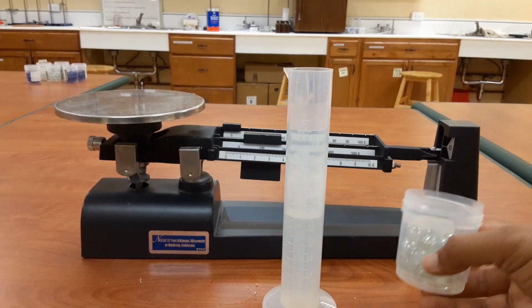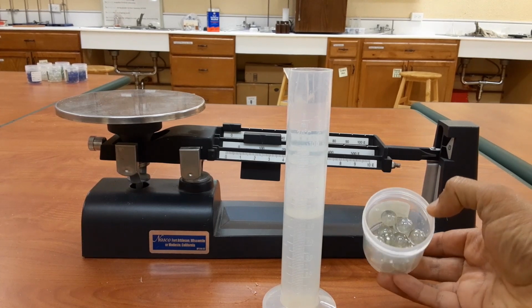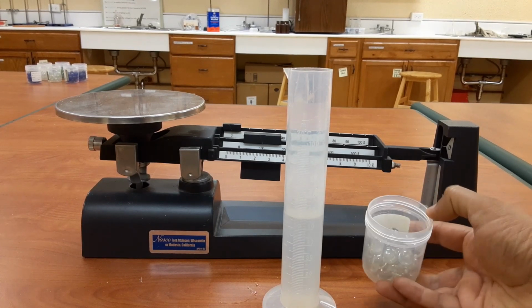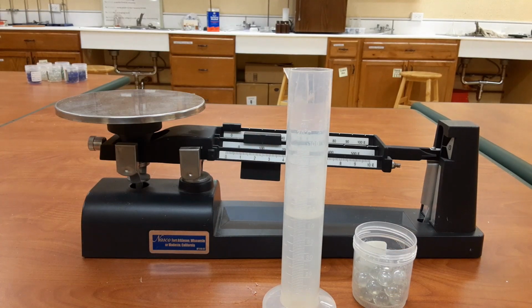Now I want to find the density of these little glass marbles, and I do not know the volume, but what I do know is that in this graduated cylinder from our previous part, we already know that the volume of water here is 54 centimeter cube or 54 ml. So please write that down. Initial volume of water is 54 ml. Also, when we did the last part of the lab, we said that the mass was 105.4 grams. So that would be the initial mass of the graduated cylinder.